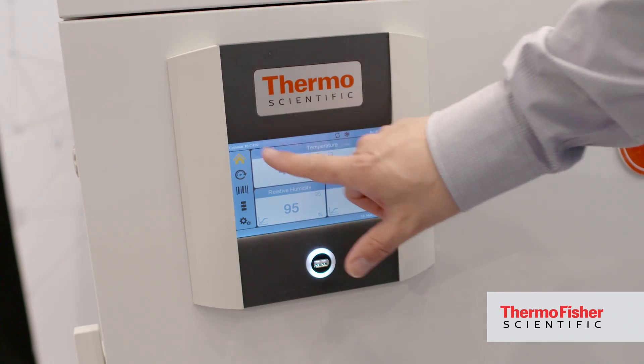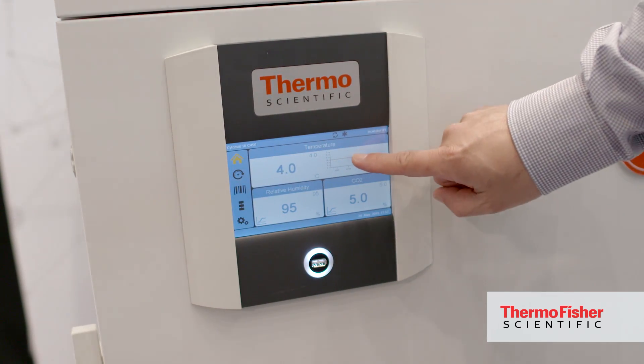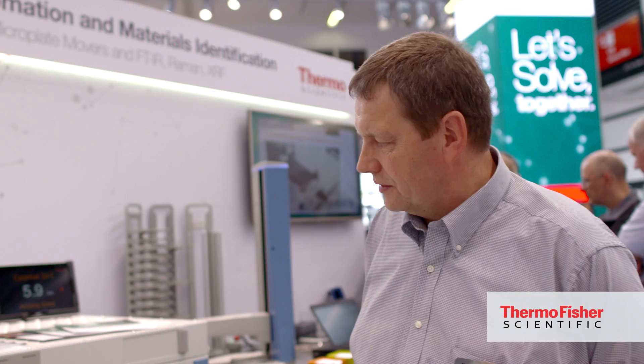Our new generation display, 7-inch and glove-friendly, is used to view the performance data online directly on the instrument. These data are also stored and can be exported via USB for later storage or long-term documentation.